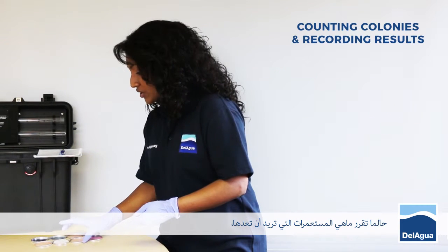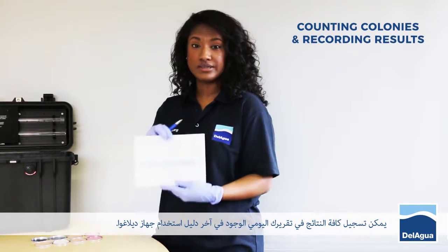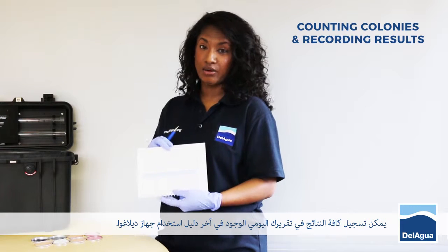Once you've decided which colonies to count, all results can be recorded in the daily report sheet found in the back of the DelAgua manual.